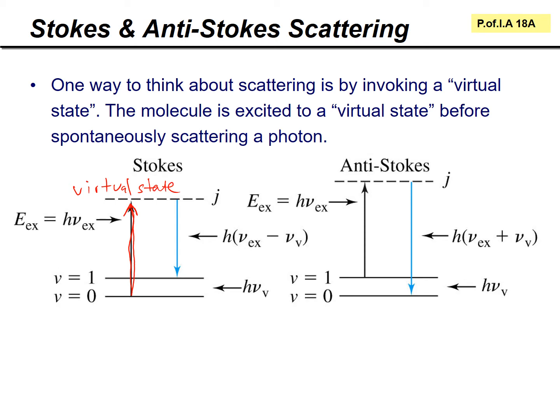But it's not really absorbed. It's just a very, very weak interaction. And then the photon is scattered. It's not emitted or fluoresced or anything like that. It's just scattered, but it's scattered with a little bit less energy. And the bit of energy missing is this bit here, which I've drawn terribly.